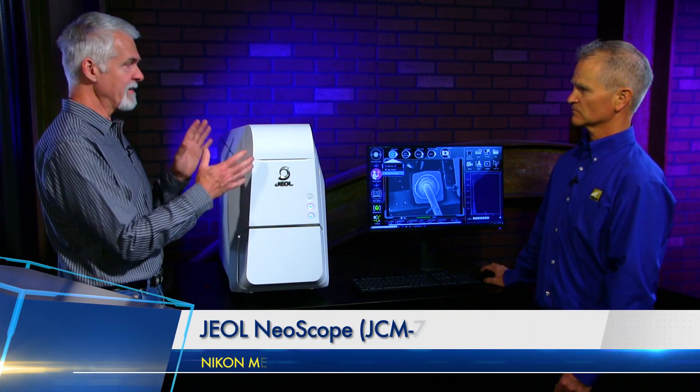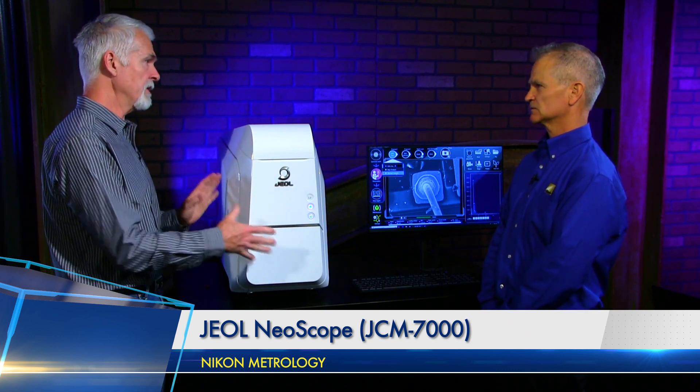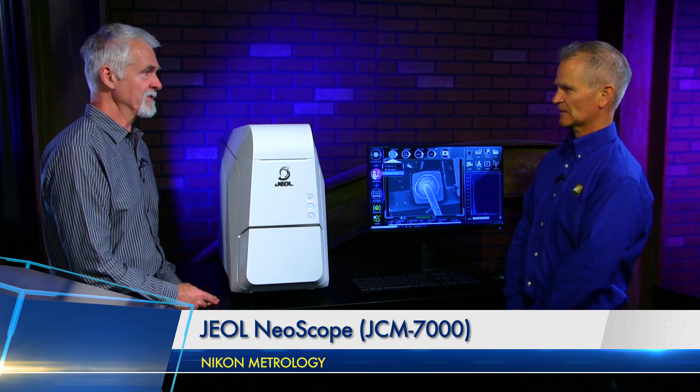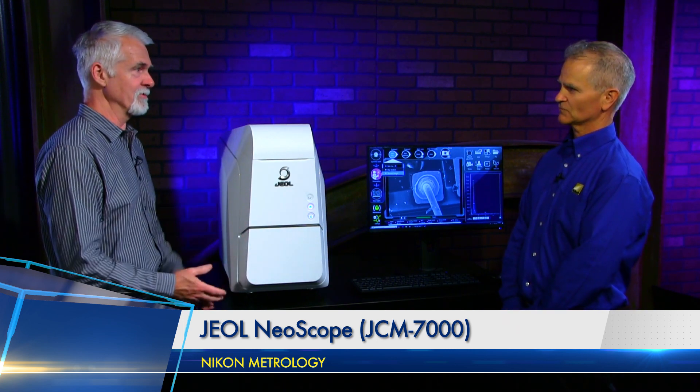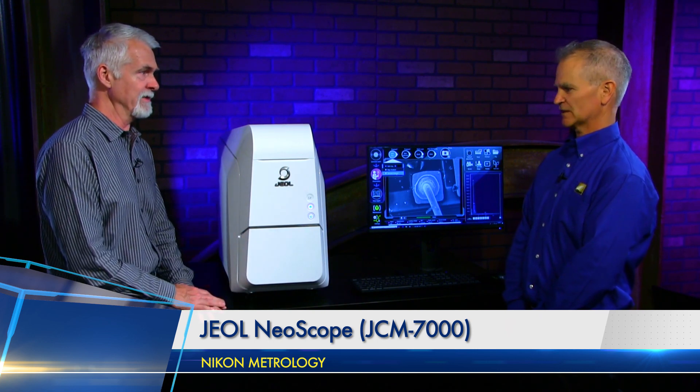All of this seems like it makes this pretty user-friendly and easy to use. You don't have to be a scientist to use this kind of SEM — it looks like you use it just like any other piece of industrial metrology equipment with a pretty simple interface. We come in and support you, do the installation and the training. Within a day, you're going to know how to operate the software inside and out.